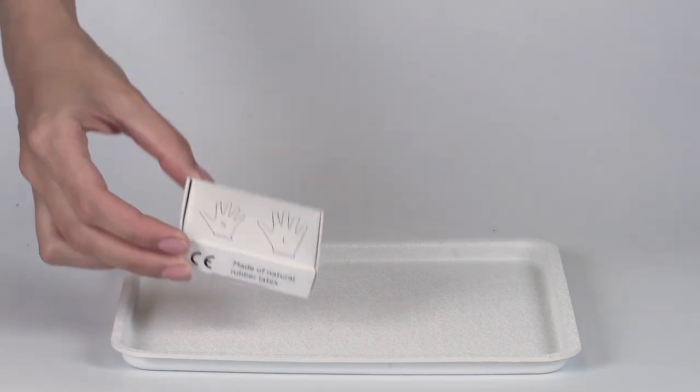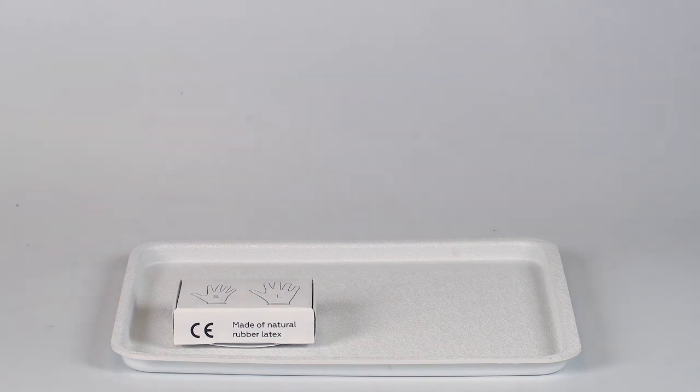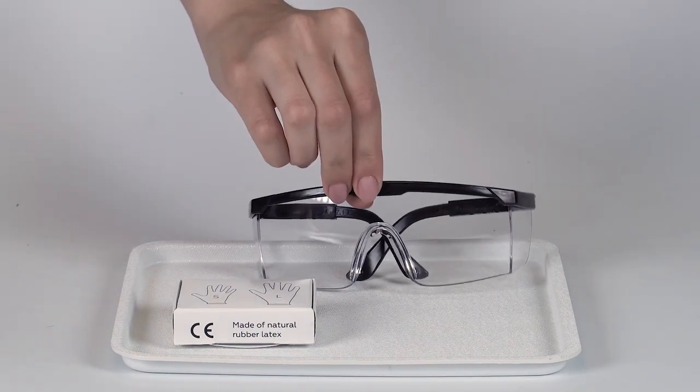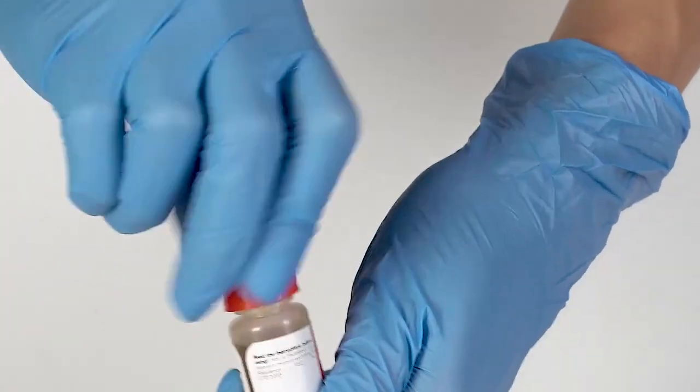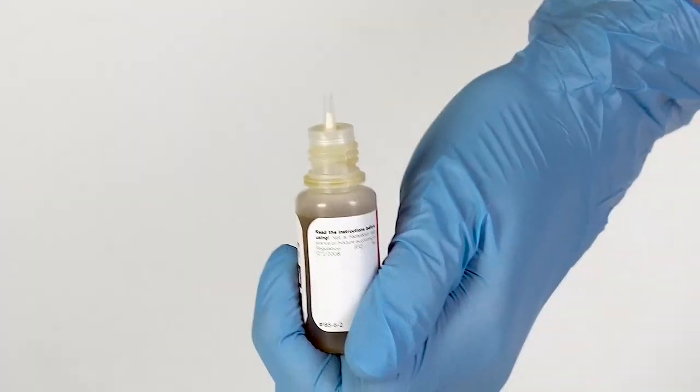Perform this experiment on a plastic tray to contain any possible spills. Don't forget to put on protective gloves and goggles before doing the experiment. To open a bottle containing a reagent, push the cap down and turn it.